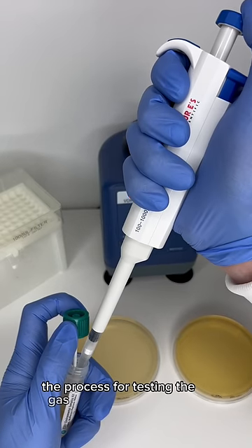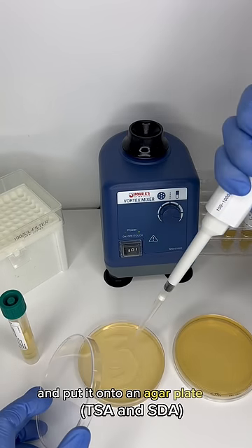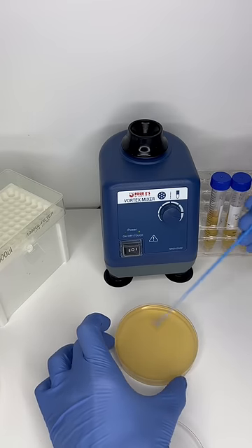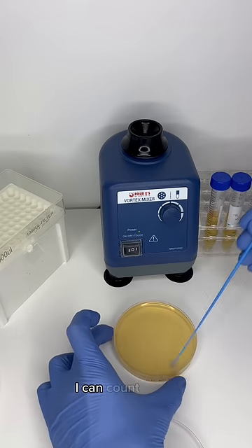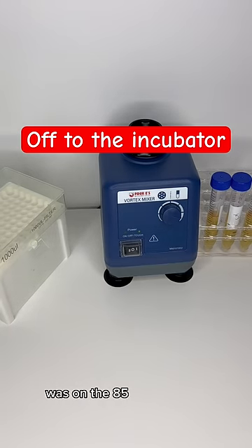The process for testing the gas pump is fairly simple. I'm going to take some of the liquid from the swab and put it onto an agar plate, mix it around, and then incubate. Once the bacteria begins to grow, I can count the amount of colonies, and from that I can estimate how much bacteria was on the 85 gas pump.